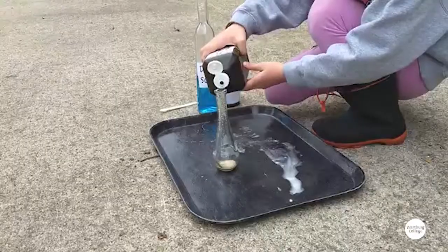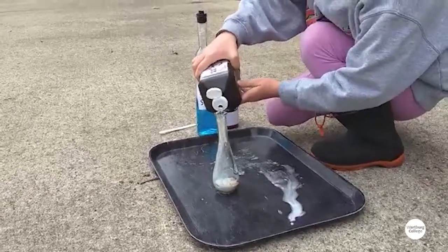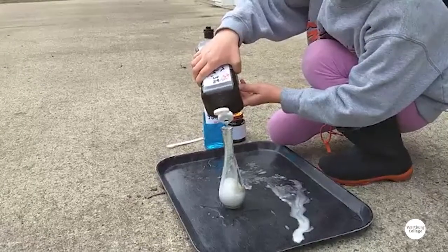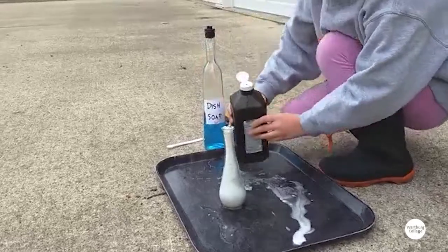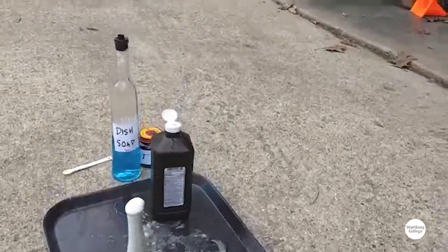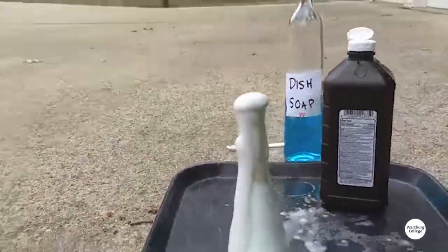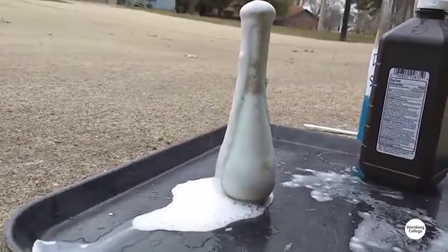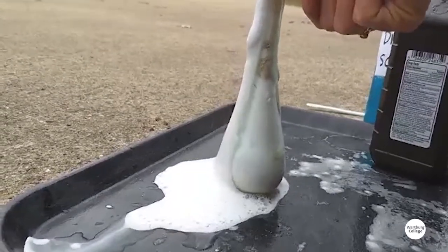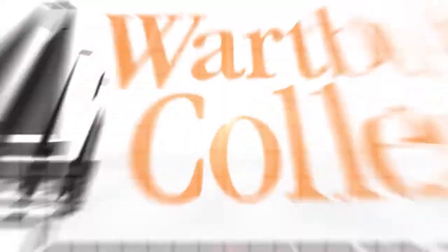This time we put the soap and the yeast in first, now we're pouring in the peroxide. Just pour it all the way in — you're good, it'll stop. What we're using is not particularly dangerous — it's the stuff we use on our injuries. That is a good little volcano, isn't it? If you don't want to wait for it, let's leave it out there for a while and come check on it later and see if it's empty. I still see the yeast in there, so it's going to be reacting for a while. You can make your own erupting elephant toothpaste.